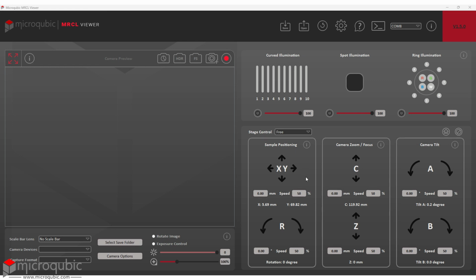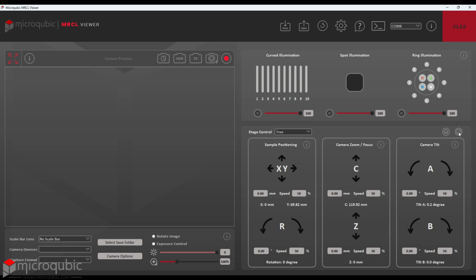The position values of the actuators should automatically refresh whenever an actuator stops, but you can also refresh manually by pressing the button here. During homing or regular operation of the microscope, if you observe an undesired movement, you can stop all actuators by pressing the emergency stop button.